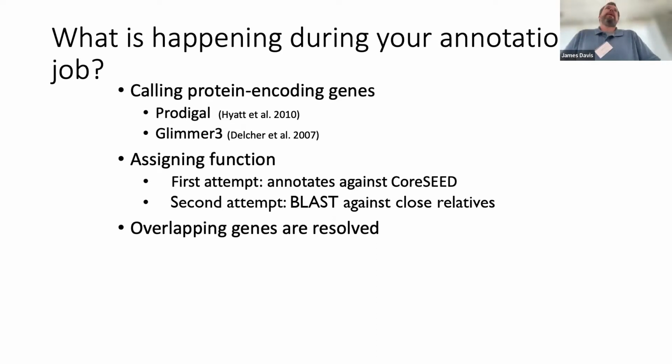In the world of RAST, what our annotators try to do is assign one or more atomic protein functions to a protein itself. Those are called functional roles. You can have a protein with more than one of these, but essentially those are what are being annotated onto your protein encoding gene whenever it gets run through the annotation system. And this is done through hashing, these signature k-mers that are signatures of specific functions.